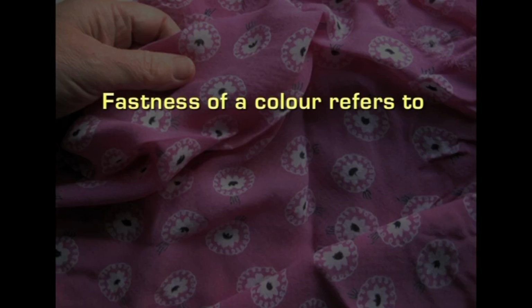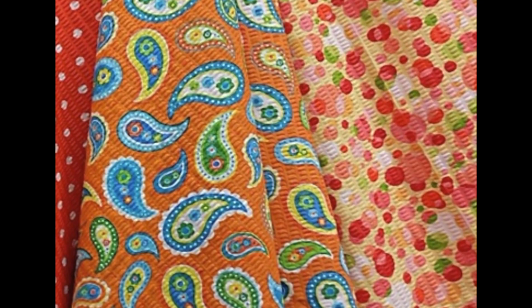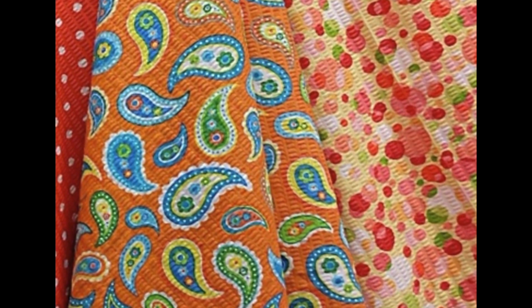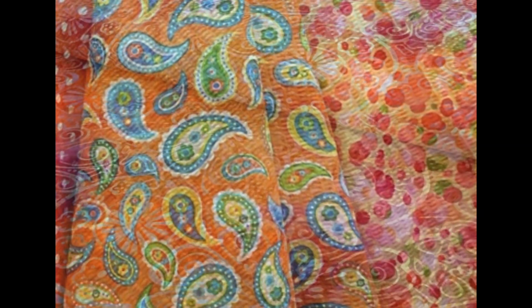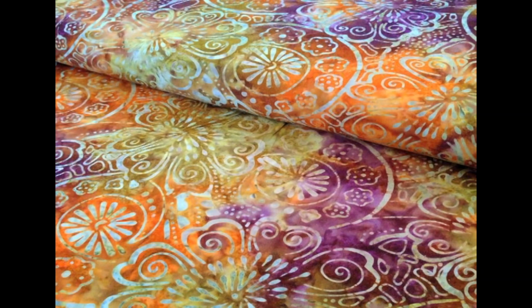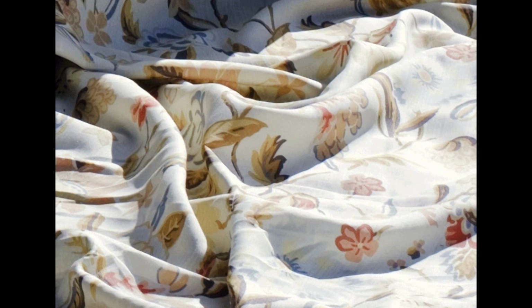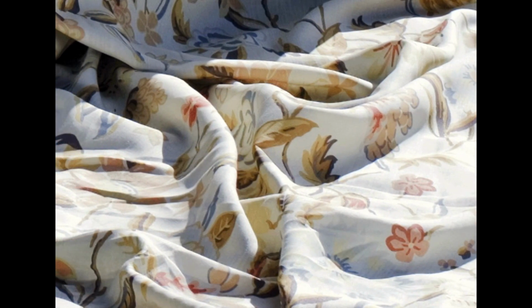Fastness of a color refers to its permanence, or its ability to remain unchanged throughout the useful life of the article to which it has been applied. So, good color fastness means that a pigment or a dye which is applied onto the textile material needs to remain in its original shape and consistency throughout the useful life of the product or the textile material.